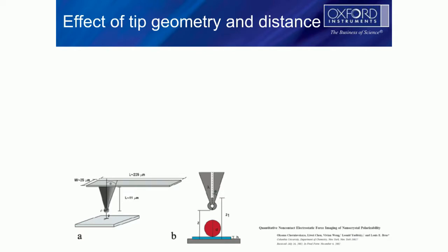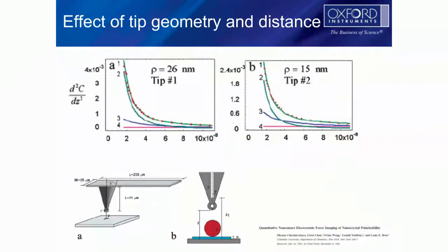What that means, though, is that when you stop and you apply the bias, and that AC bias, and then you're canceling it, you're actually above the surface by that amplitude. So you actually have to lower it. So we talk about lift mode or nap mode or whatever. The bottom line is that you're starting out above the surface. So you typically need to use negative lift modes. And let me show you where this comes from.